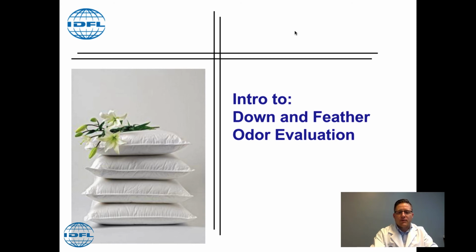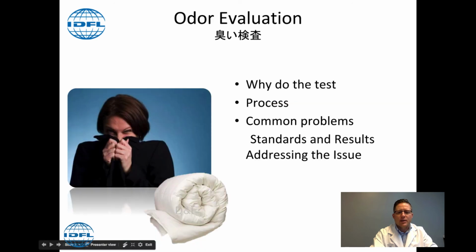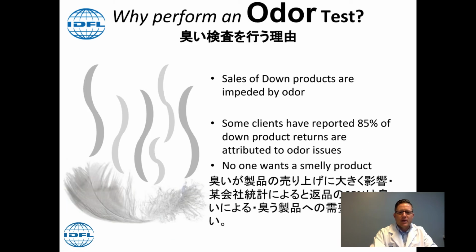What I wanted to go through first off today is understanding what the odor test is. Second, how it is actually tested, and then some common problems and solutions. Starting off with, why would you go through and actually perform a test?